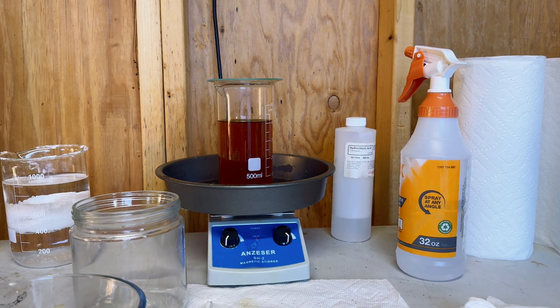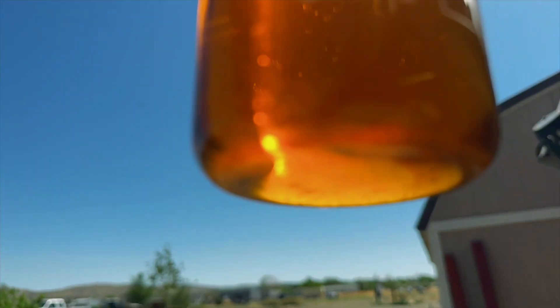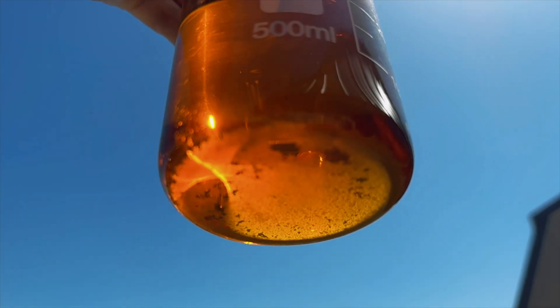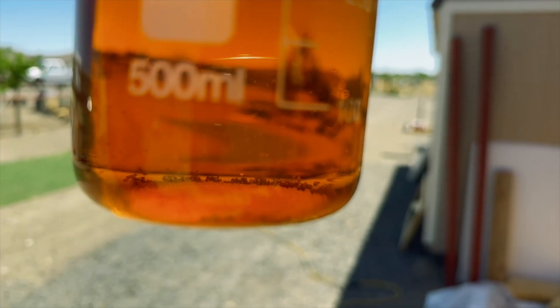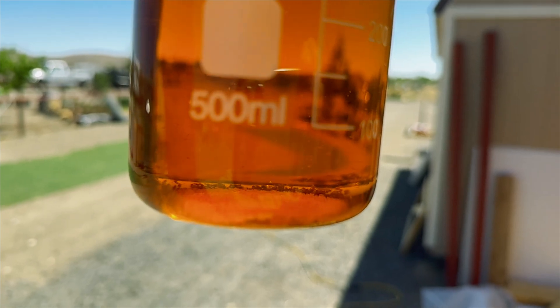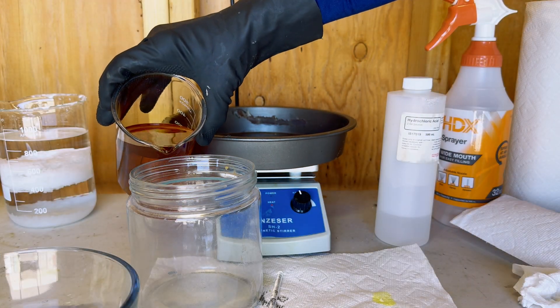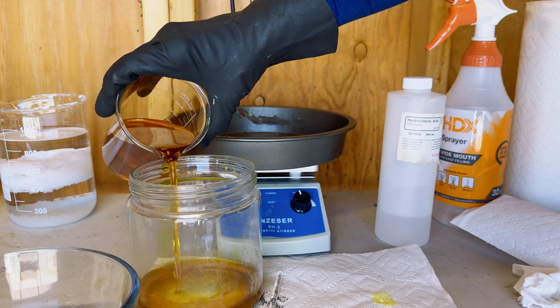Since we have come this far, I am going to let this precipitate overnight and see if we get any type of a gold drop. Now it is the following morning and you can see there is hardly anything on the bottom of our beaker from our precipitation of our aqua regia. We will pour out our aqua regia and then give this a rinse and we'll see if this is gold drop in our beaker.